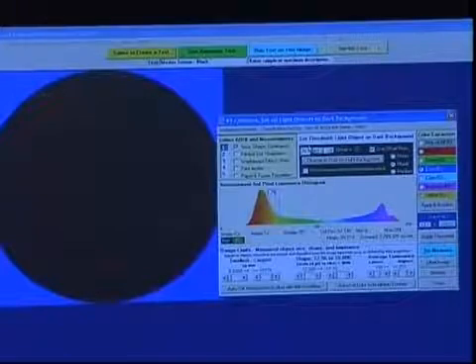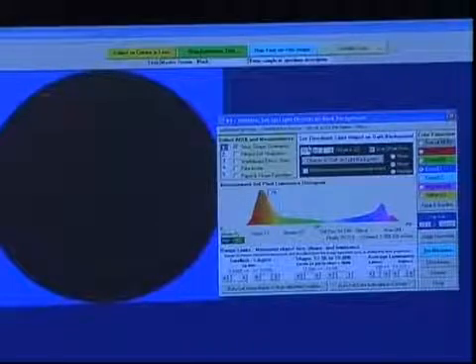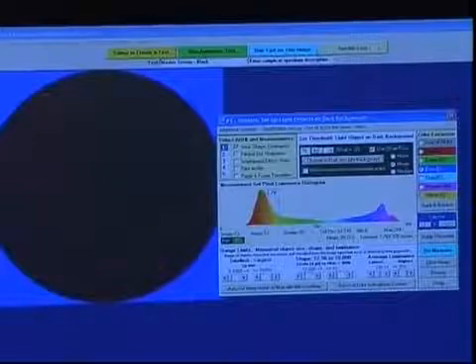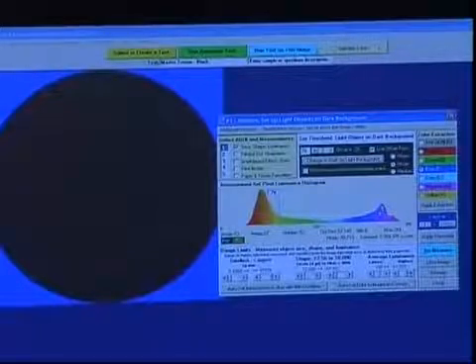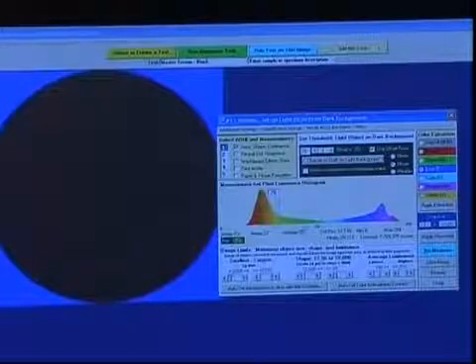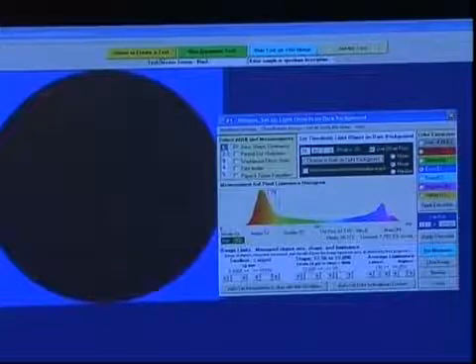So the threshold has to be above the mean instead of below the mean. Very easy. You can see the image is bimodal. There's an awful lot of things in this image. This peak is probably the white stickies, and these are the hairy stickies down here. But we're setting up stickies in the first AOI.